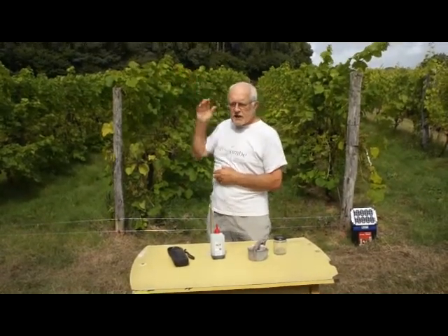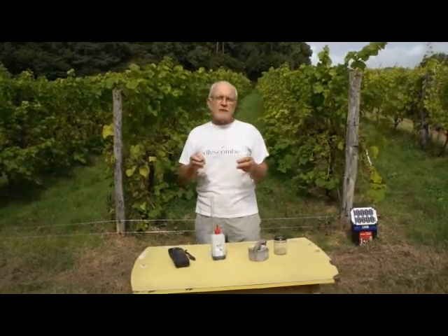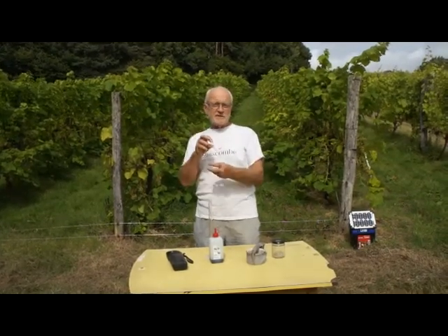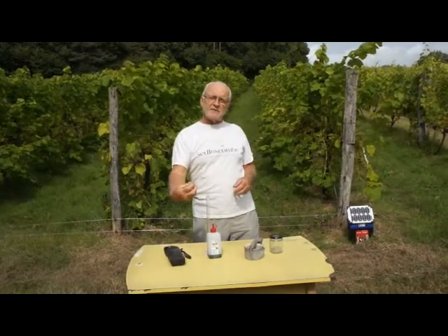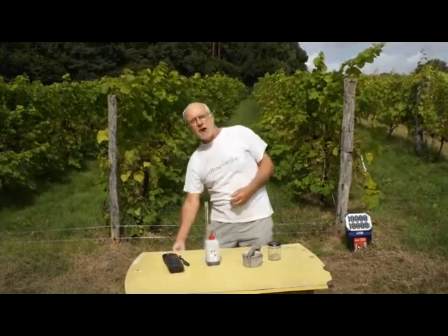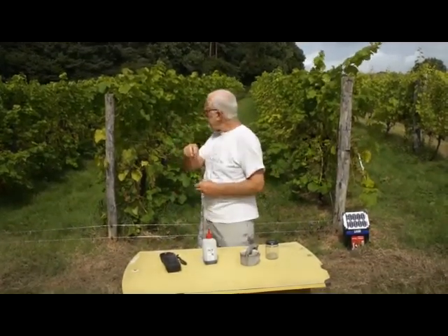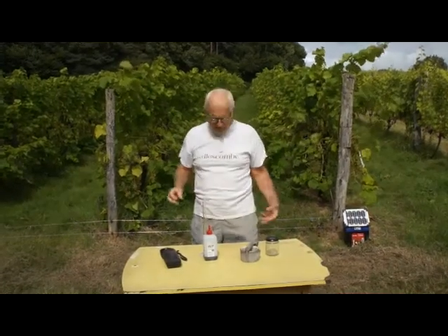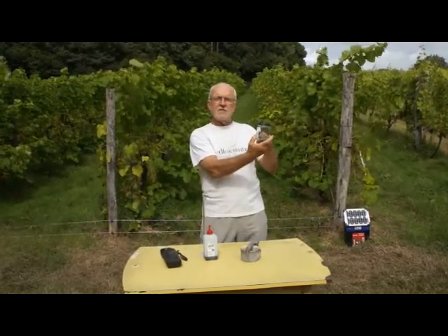We're going to select a few berries from several bunches — some berries from the front of the bunch that are in the sunlight, some berries from the back of the bunch that haven't seen much sun. We're going to select some from down low and some from up high, some small ones, some big ones. We're just going to try and get a representative sample, about half a jam jar full.